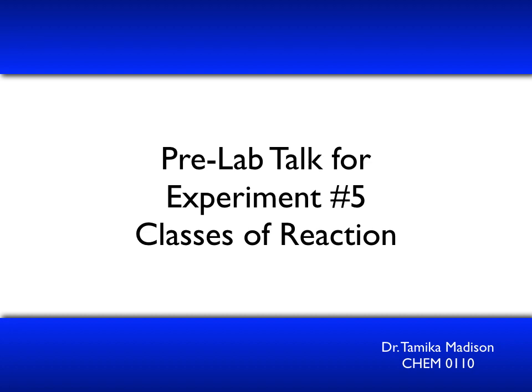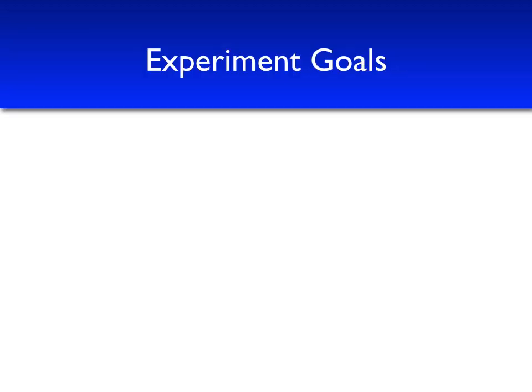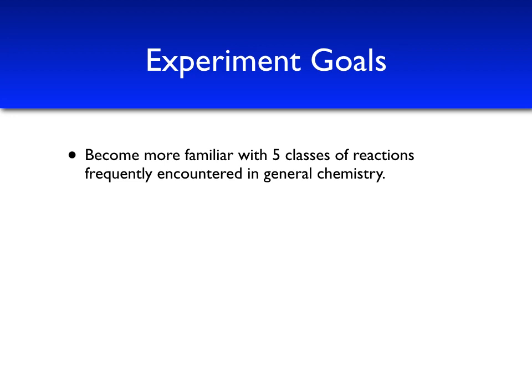This is the pre-lab talk for experiment number 5 for Chem 110 lab, classes of reaction. The goals for this experiment are to become more familiar with the 5 classes of reaction that are frequently encountered in general chemistry lecture.